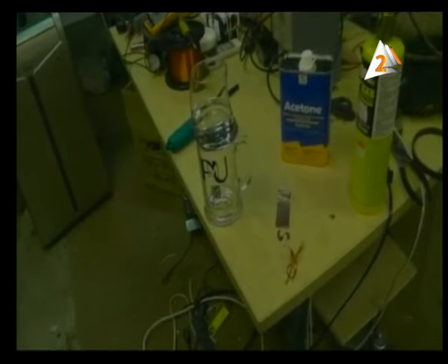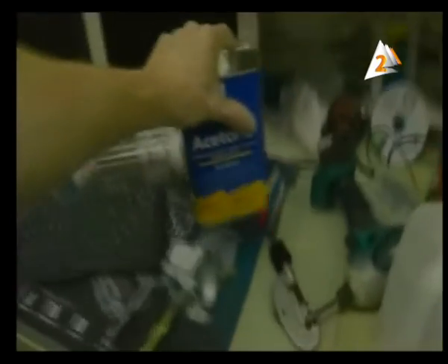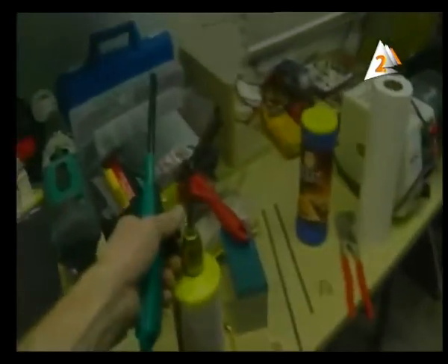Be careful, my lovely students. This reaction is dangerous. So we have the fire extinguisher as you saw before, and all the time we say, take care, close the bottle of the acetone well and keep it away from the reaction, because we don't want to make an explosion of these materials. Keep every part away. This is flammable, flame. Why make it away? Because we have a danger.